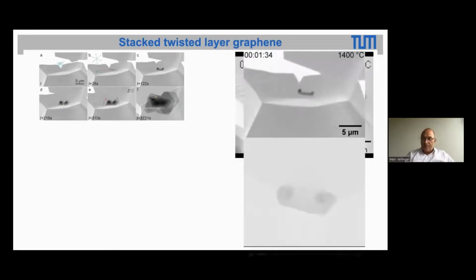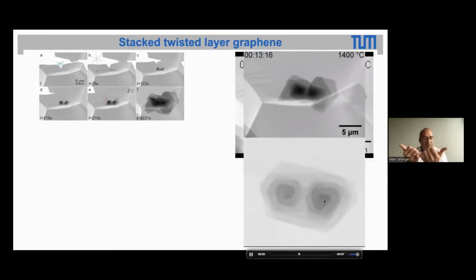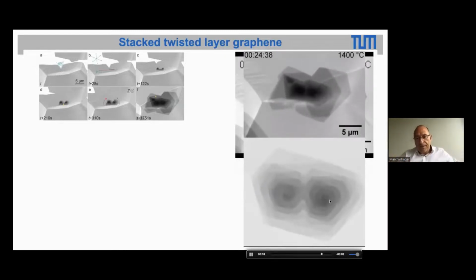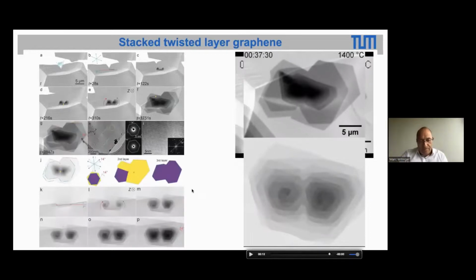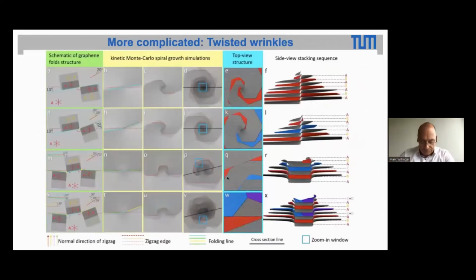And so here's the experiment, here's the growth simulation. So there was a wrinkle with a front and the bottom end. Each wrinkle has a beginning and an end, and it forms a spiral also from there. And then my former PhD student and postdoc and now Professor Jun Wang, he analyzed all little tiny features of wrinkles, and he found many different fantastic configurations of wrinkles. If, for example, a wrinkle is not straight but folded, you can have very complex combinations. And this goes now too far.